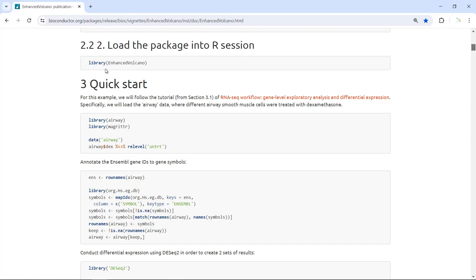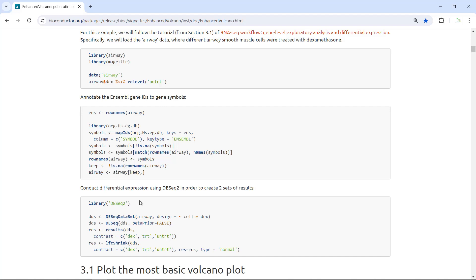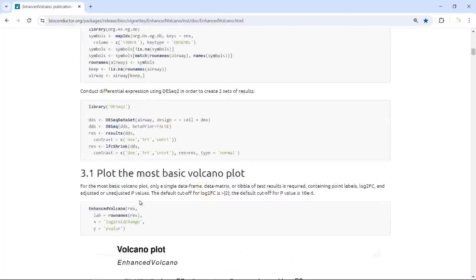Once you install the package, we can load the package. I'm going to use the data generated by the online tutorial, but I saved it as an Excel dataset because you may have a different dataset. You can use functions such as DESeq2, edgeR, or FindMarkers from the Seurat package to identify your differentially expressed genes. Then we can make the plot.